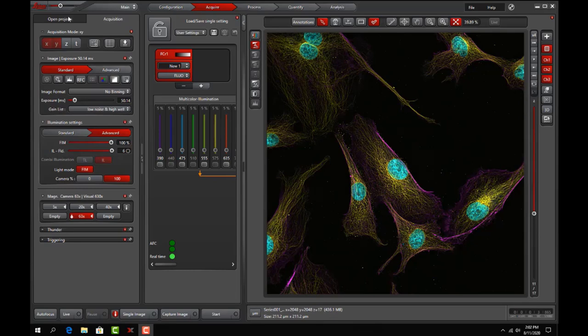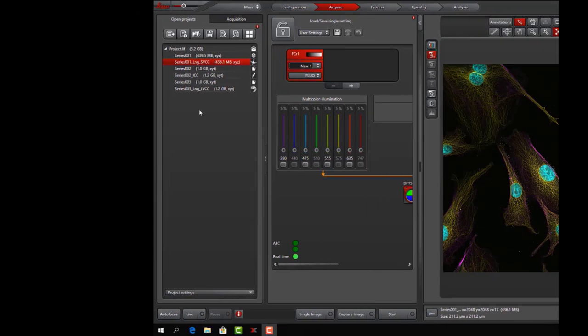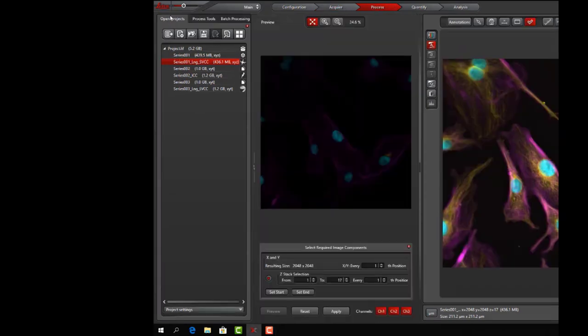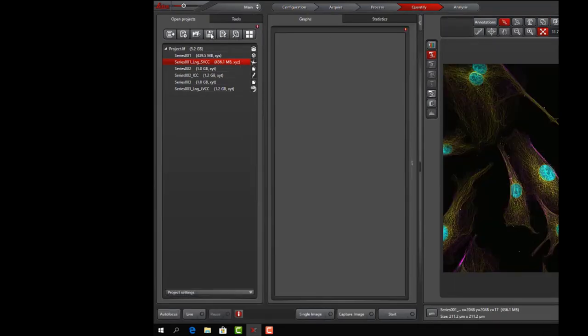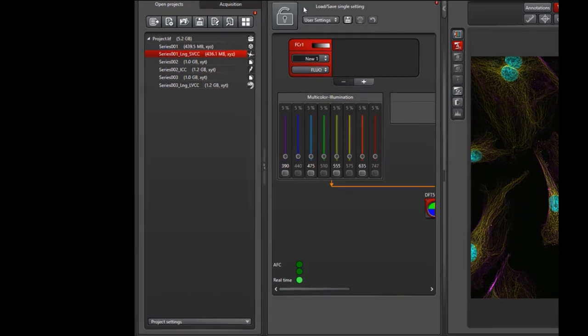This can be done within the Open Projects tab. An Open Projects tab has been placed in several different parts of the software to make it easy to reference no matter where you're working. Notice we have one in the Acquire tab, in the Process tab, and finally the Quantify tab. This is helpful if I'm quantifying data, I can easily reference it from within this tab rather than having to go back to the Acquire tab. We'll work within the Acquire tab.